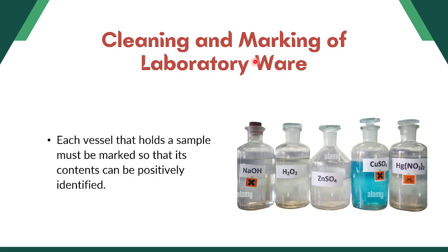Now, for every group, I want you to prepare a ball pen or in a way, a black marker, and scotch tape nga pwede masulatan, in which ma-determine nato ang proper label ani, unsa ni siya nga chemicals, especially kay almost ang mga chemicals natong gamiton kay mga transparent, murag tubig, like murag tubig og properties ba, physical properties. So much better nga proper label gid, no?